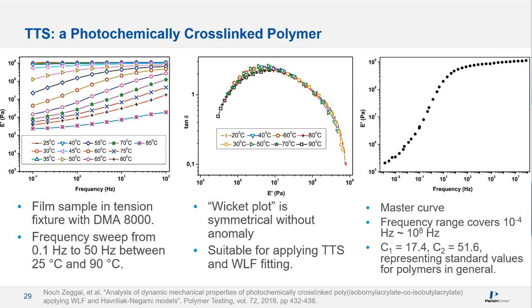The data of the storage modulus do not seem to change significantly, also on this log scale Y scale, in the frequency range between 100 Hz and 10 MHz. So this also suggests that this material does not significantly risk fracturing at higher frequencies.